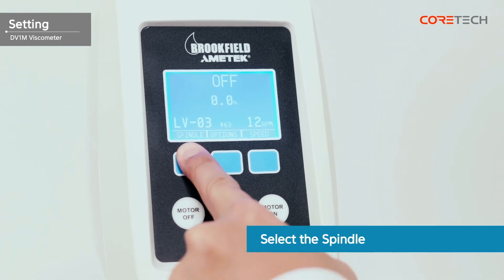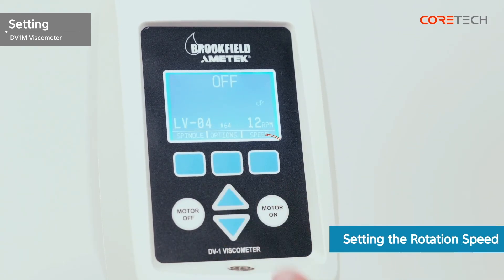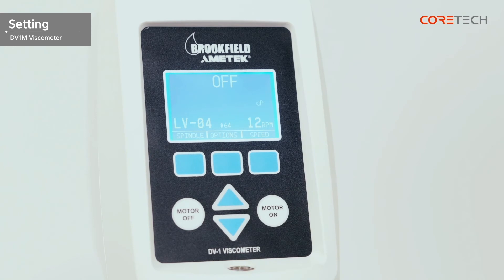Press the Spindle button and select the spindle number that is joined to the body. Then press the Speed button and use the arrow buttons to set the desired rotation speed. For low viscosity samples, select a high RPM for rotational speed. Conversely, for high viscosity samples, select a low RPM. When the spindle and RPM are set, the screen shows the maximum viscosity value that can be measured under those conditions. If the maximum measurable viscosity value is lower than the expected viscosity value, you must change the RPM or spindle. If you do not know the expected viscosity value, set the measurement range wider to check the approximate viscosity value, then narrow the range and measure again.